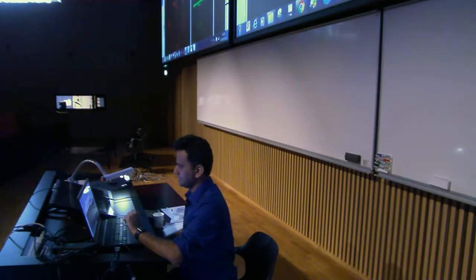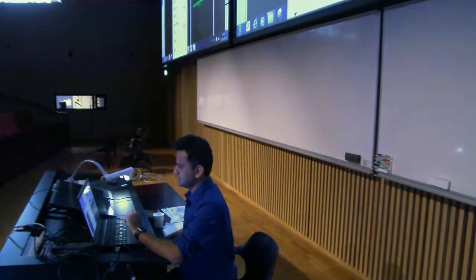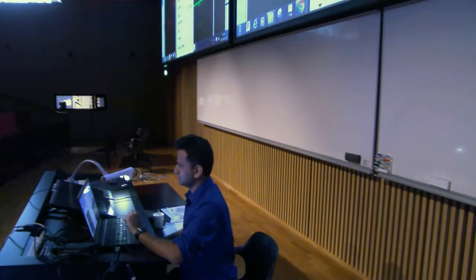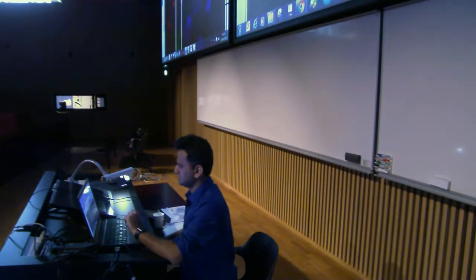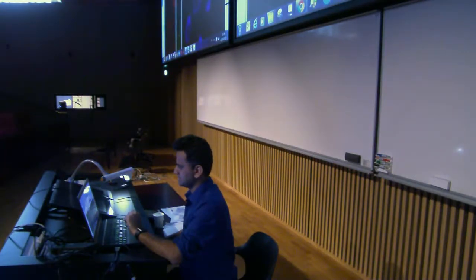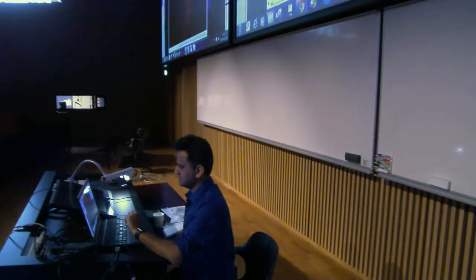Yeah, and now you save this as an RGB type, RGB. Go image, slice, images to stack, yes, everything is here, perfect.